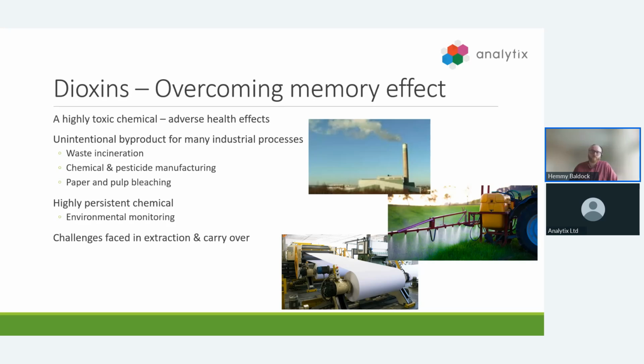Dioxin is a general term that describes hundreds of chemicals that are highly persistent. The analysis of this class of pollutant is fundamental for environmental and human health protection. Many solutions for the extraction of dioxins are available, but a common and very critical issue is not just the sample prep technique itself, but the memory effect felt in extraction cells.